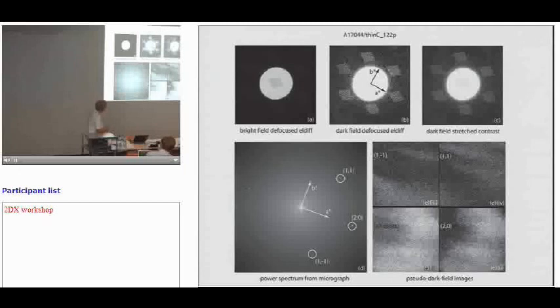Here's the 2,0, 1,1, and -1, and this is all of them together. So there's a bad bit of the crystal, but yet if you look at the electron diffraction pattern, it's perfectly oriented, it's not tilted, every part of it is beautiful. And you look afterwards and it's just the same, apart from the bit where you've burned it. So what's happening is that the image is moving around and blurring it, and the same thing that causes the intensities to fade in the diffraction pattern, the blurring, is what you see here.